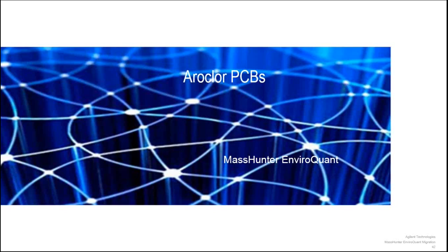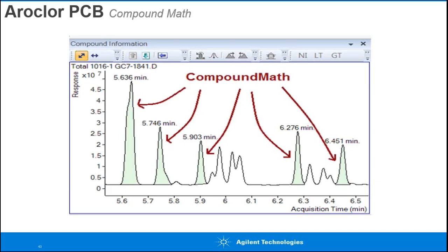All right, Aroclor PCBs. Again, you might or might not be doing this, but if you are, there's a workflow typically done in GC, and I'd like to take you through that. We support that workflow with, again, compound math.